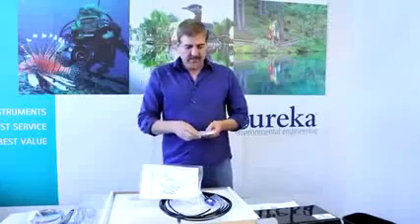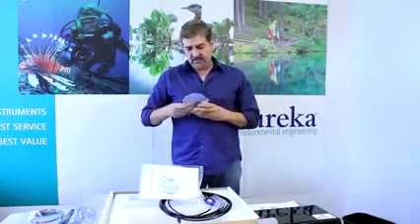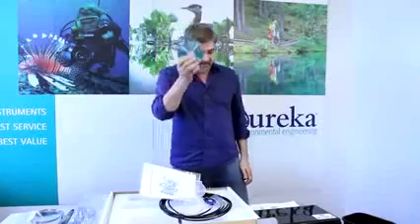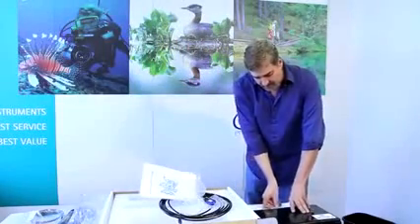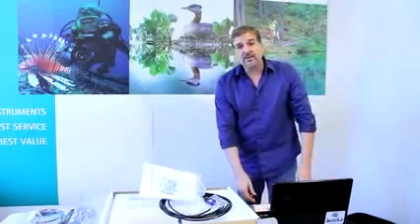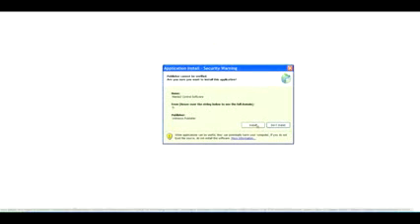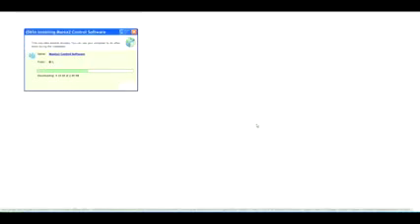Now this comes in, it says install me first, right on the label. And of course this will be label side up. We'll install it into the PC. And we'll walk through the screenshots. Now the screen comes up. It says that publisher needs to be verified. This is a Windows formality. Just go ahead and say continue.